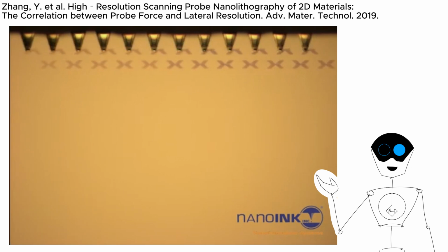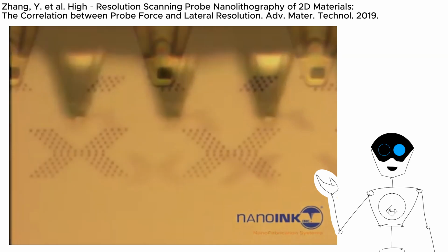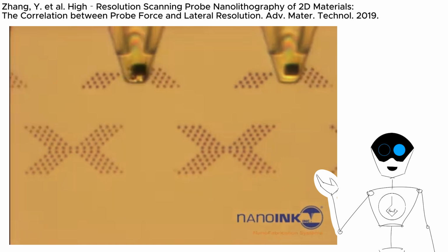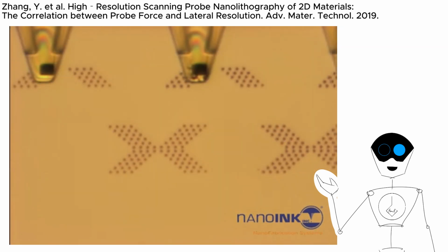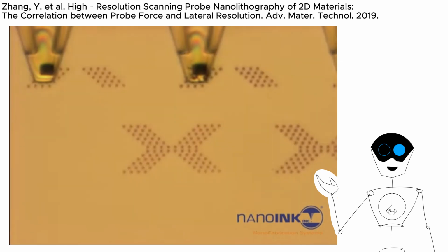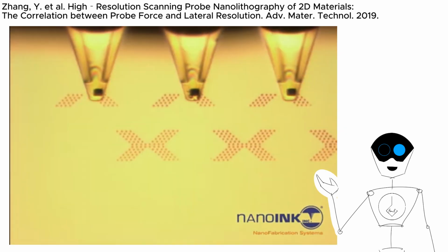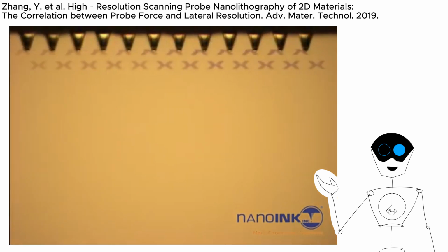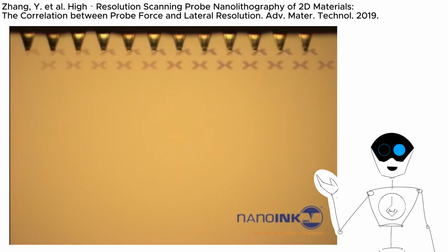The deformability of PPL probes allows the modulation of the printed feature properties through the amount of force applied by the probes. This technique has been employed to covalently print and bind functionalized cyclopentadienes onto graphene via a Diels-Alder reaction, demonstrating the capability to drive chemical reactions through mechanical force.